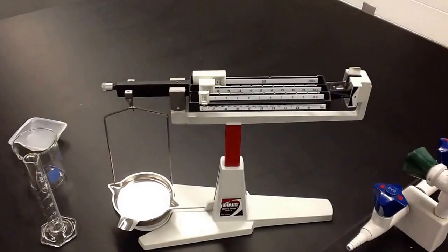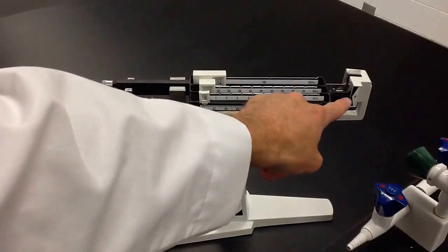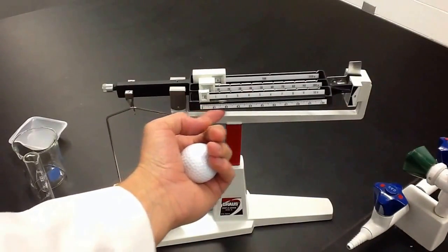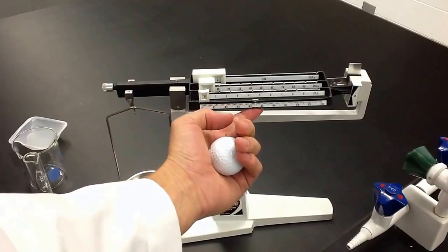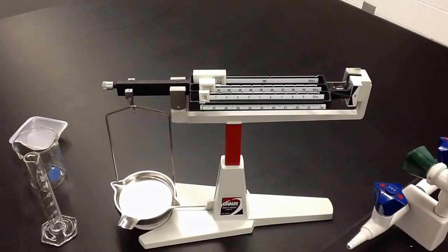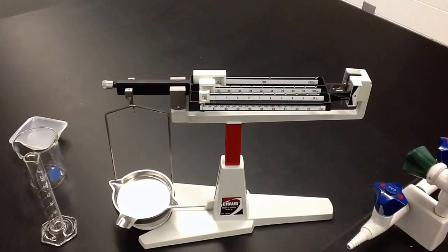You want to make sure it's zeroed out first of all. That means that right over here, this is on the zero when there's nothing on the balance. There is a little slide thing right here in front that a lot of people don't know about, and you've got to make sure that's over to zero too. This is zeroed out and so we're ready to go.